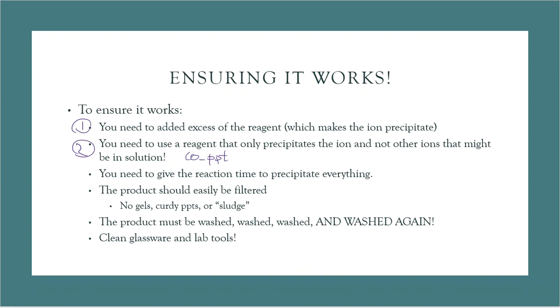Number three, you've got to be patient. Folks, you would not believe how many times I have to tell people to go back and do this lab over again because they were not patient. They wanted to rush this system through. And if you rush, your numbers are going to be horrible. I'm going to look at them and make a face like, ew.